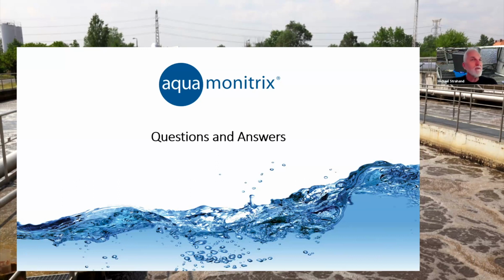Just another question coming through on that final application on the denitrification. The question is around: was there any pre-treatment needed for that? No, there wasn't actually. It was post aeration, and the sample was to the point of a final effluent, really. But in terms of solids and all that type of thing, we didn't need to do any pre-treatment. It was just a direct install of the analyzer. And yeah, it was a straightforward application.